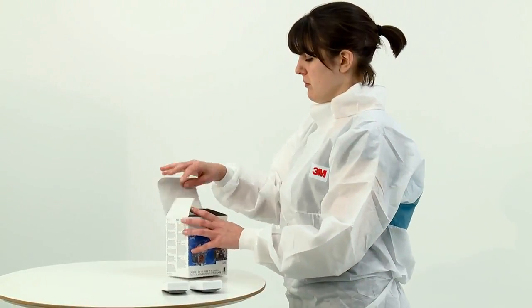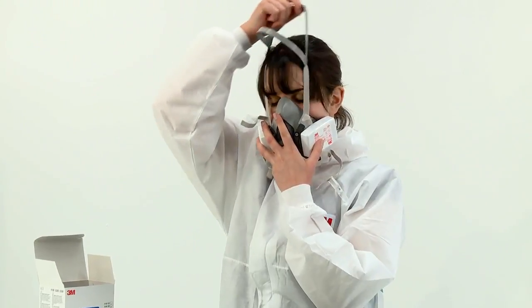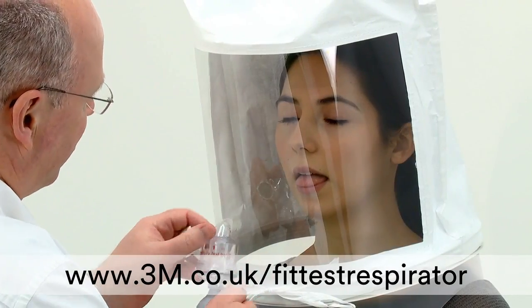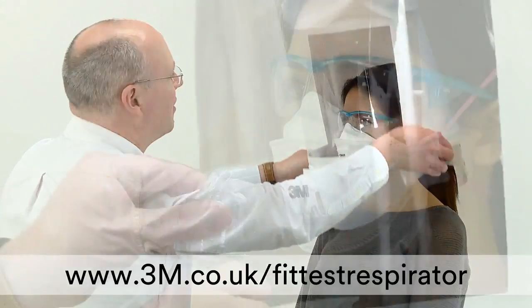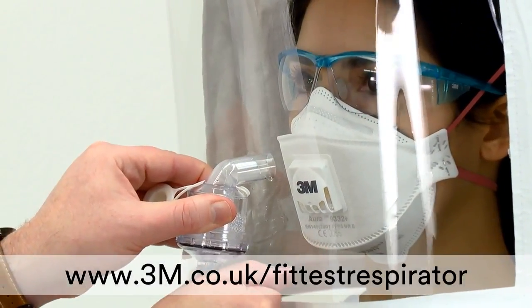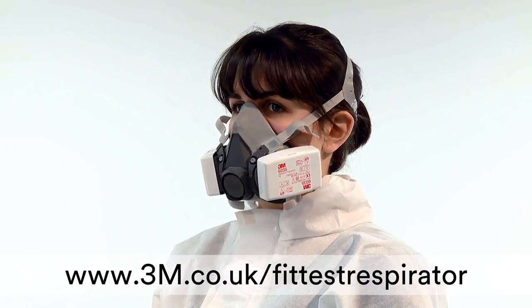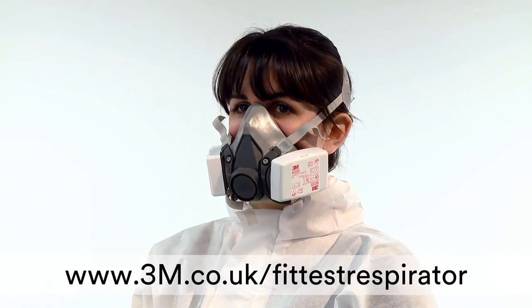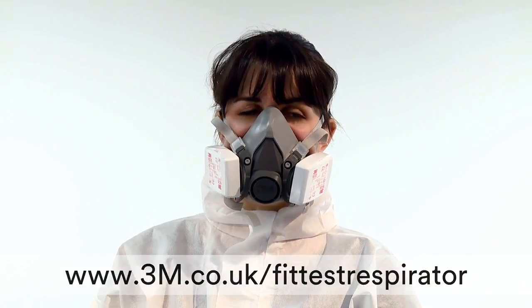The performance of your respirator relies on an adequate seal between the respirator and your face to ensure contaminated air does not leak in. The method of measuring whether or not you have an adequate seal is to pass a face fit test. Fit testing should not be confused with a pre-use fit check, which should be conducted every time you use your respirator. For more information on fit testing, please visit www.3m.co.uk/fit-test-respirator.